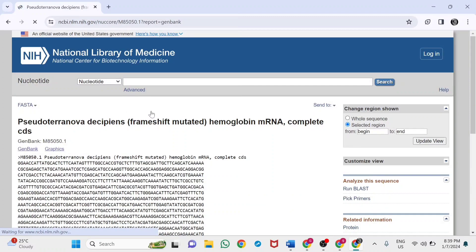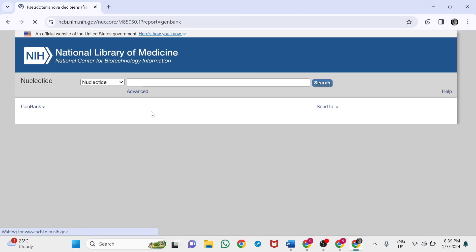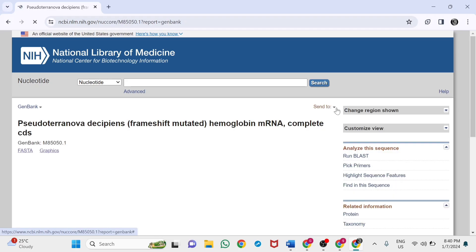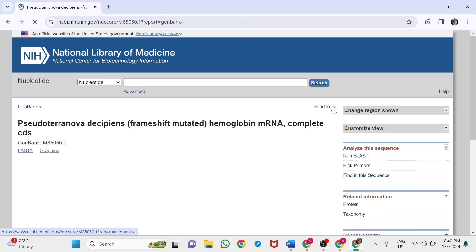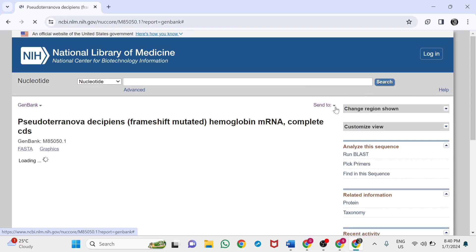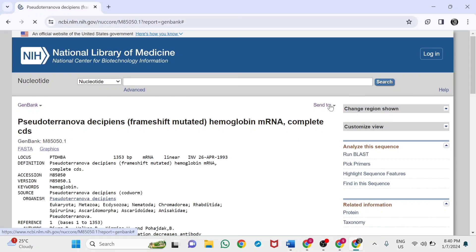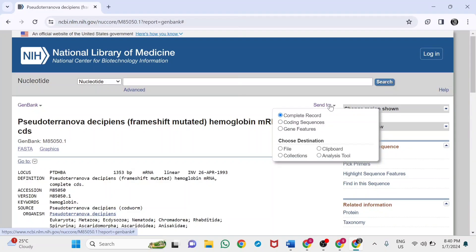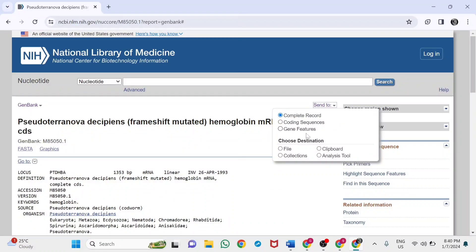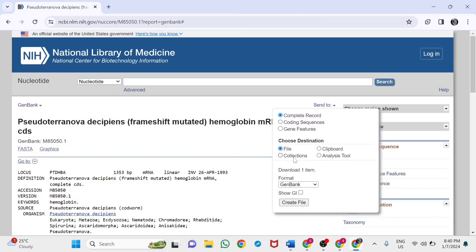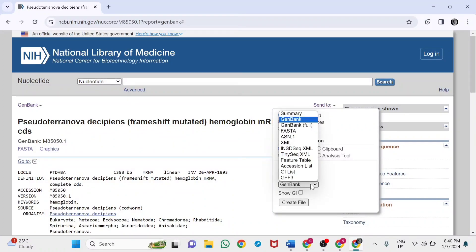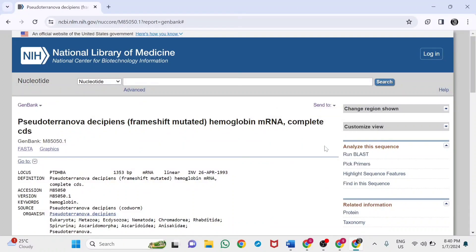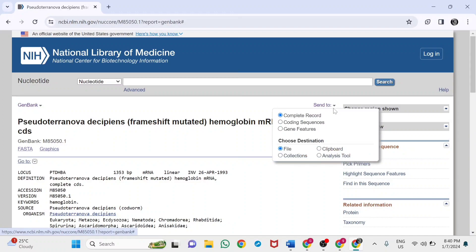Just click on the Send To option. I'm going to download this format. Click on File, choose which format to download. I'm selecting GenBank format. We can also download it in FASTA. Just click Create File.